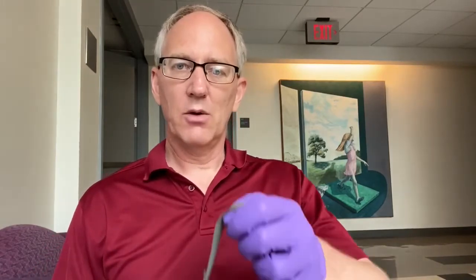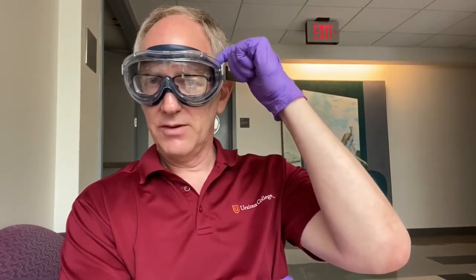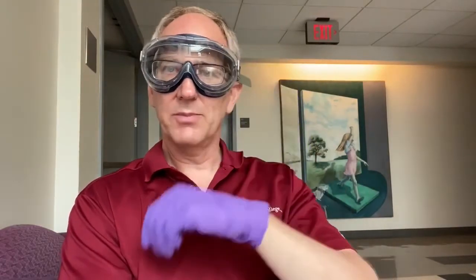First, we'll go over some safety rules. Whenever you are in the lab itself, no matter what you are doing, the most important thing is that you are always wearing your safety goggles. We require safety goggles and not safety glasses because with safety glasses, you could have something splash up on your forehead and then drip down into the corner of your eye. But with the goggles, you have a very tight seal and nothing can possibly get in your eyes. Let me emphasize that whenever you are in the lab, you must have your goggles protecting your eyes. Otherwise, you'll be ejected from the lab and sent home with a 0.